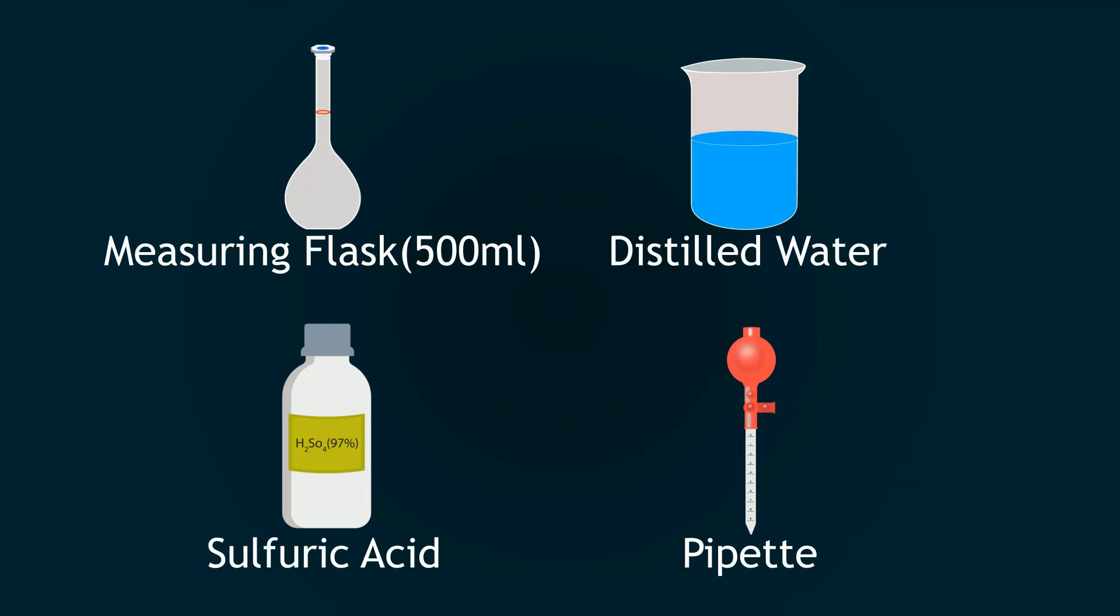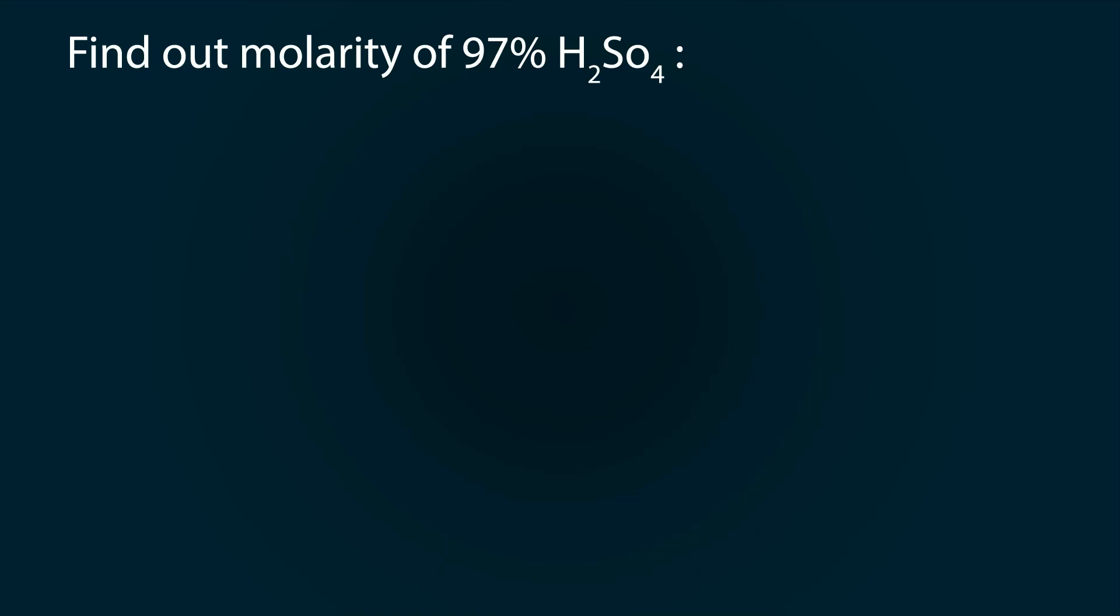The required apparatus and chemicals include: volumetric flask of 500 milliliter, distilled water in a beaker, a sulfuric acid bottle, and a pipette.